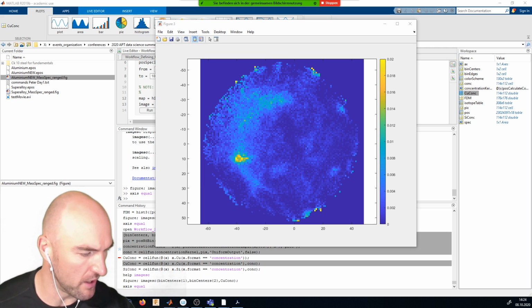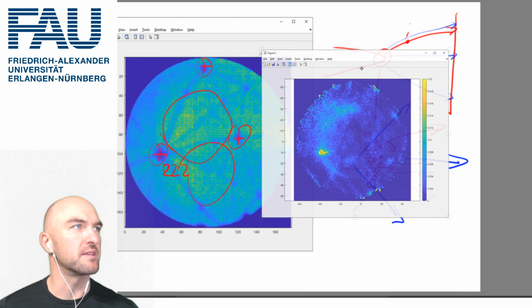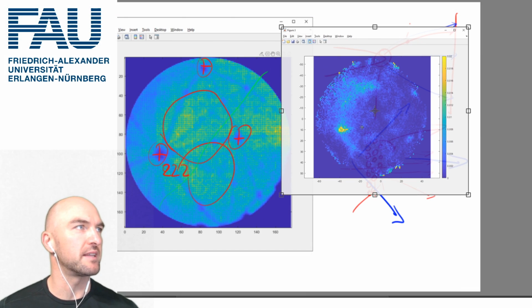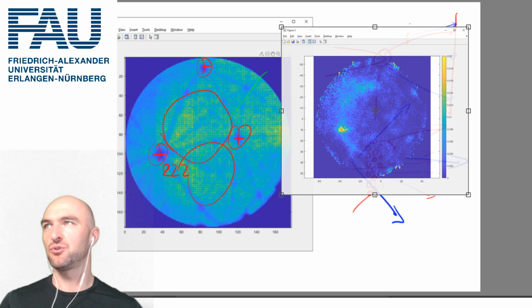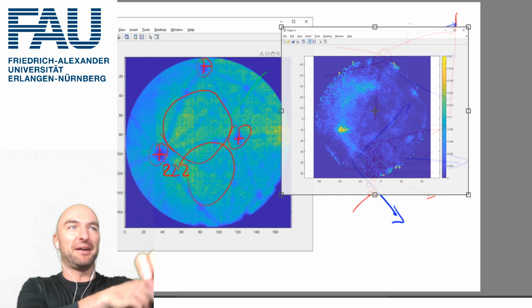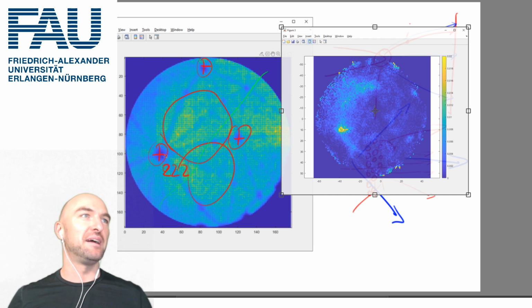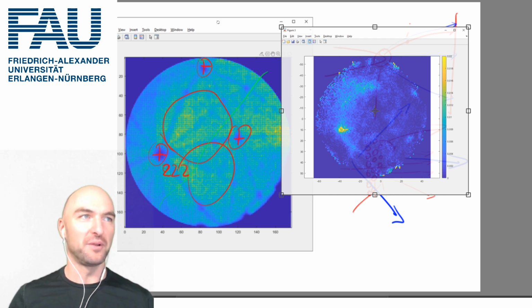And compare it to our other figure that we had, and what you can see right here is obviously that there's a lot more copper where this 0, 0, where this 2, 2, 2 pole. I think it's a 2, 2, 2. If you do a lot of aluminium and you know that better than me, then tell me, okay, no, this is a 1, 1, 1, 0 pole or whatever pole it is.